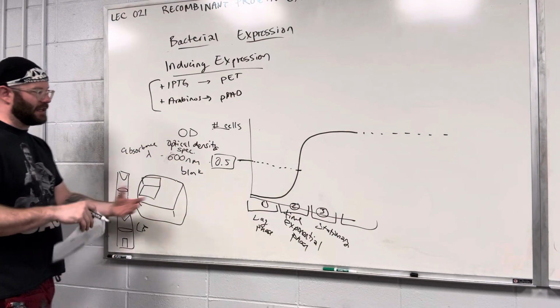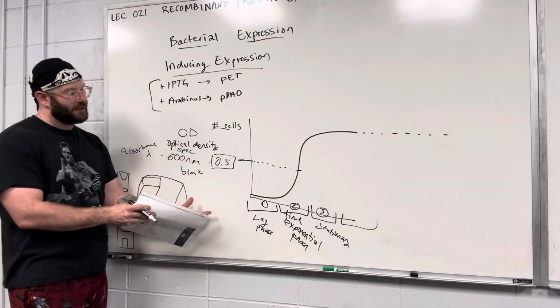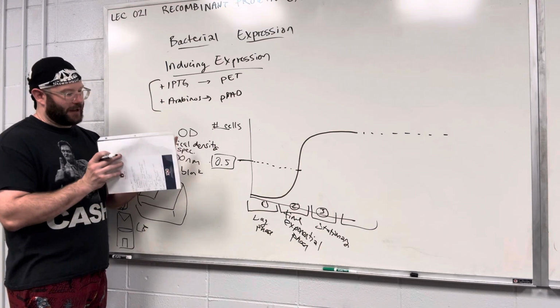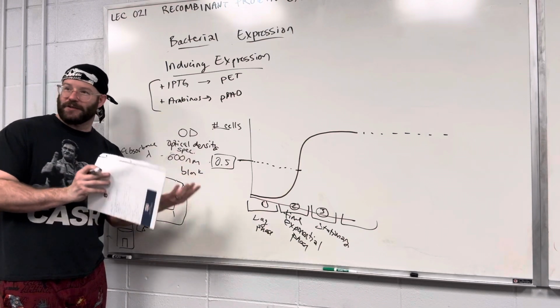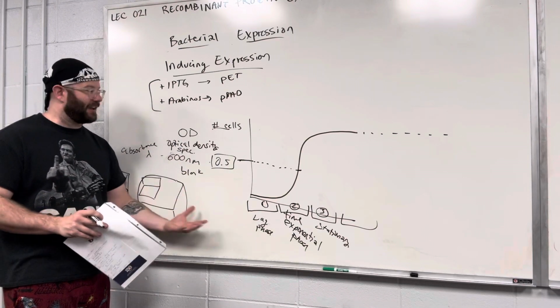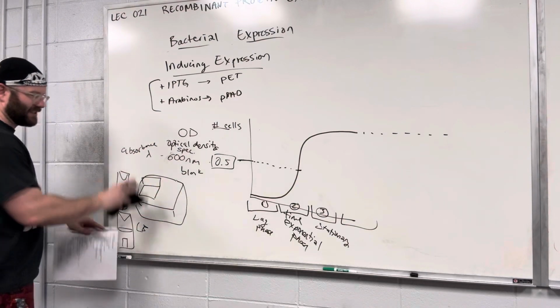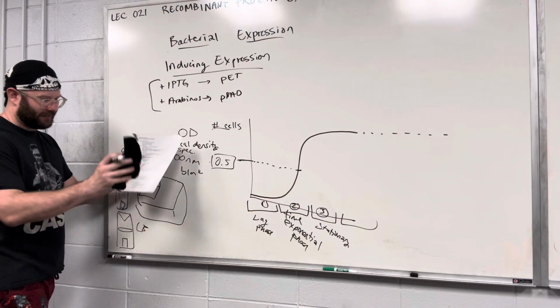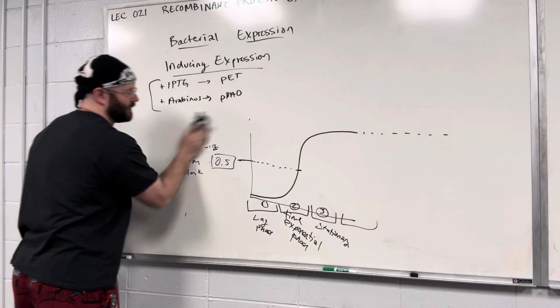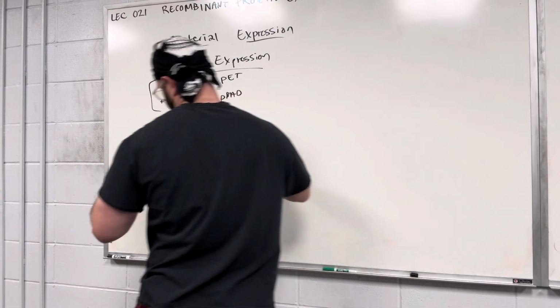Okay, so this is a key, crucial thing. If you ever do recombinant protein expression, please remember this. I worked with people who didn't understand this, and they wasted years of their PhD trying to induce proteins at the wrong time, and lost years of their life because of this. So this is a very important thing, and it's also just fundamental microbiology for recombinant protein expression. Okay, so that's when to induce.